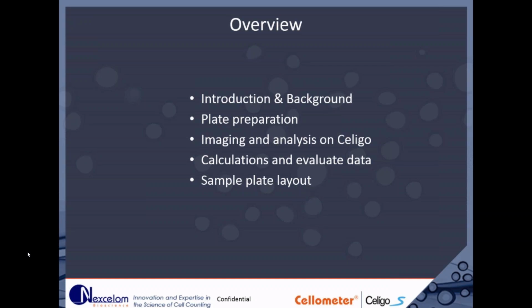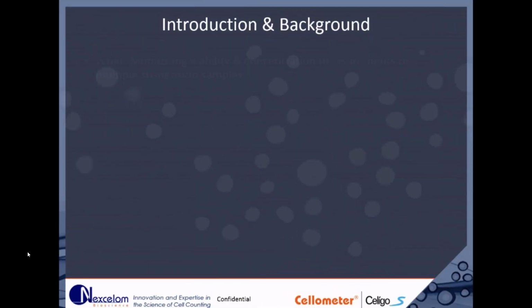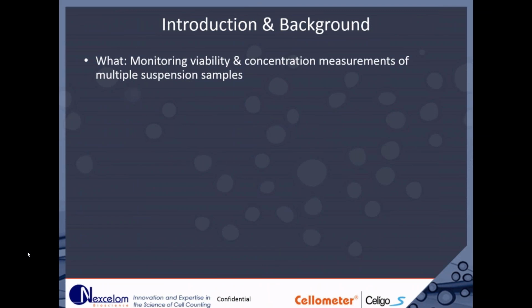Okay, so when we go into who is actually using this type of assay on Celigo, we want to first understand what it is that we're actually doing. We're monitoring the cell viability and concentration measurements for multiple suspension samples on the Celigo.